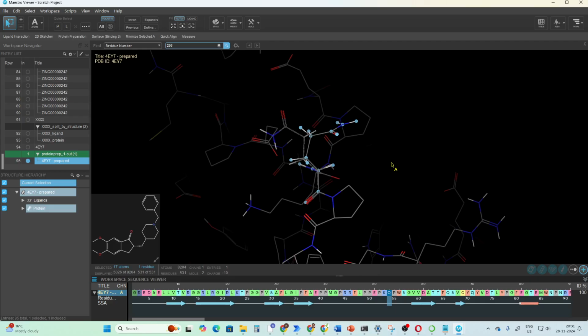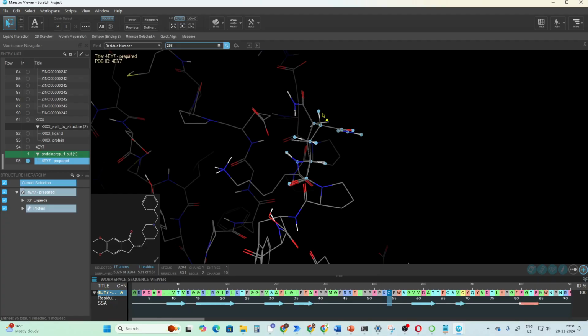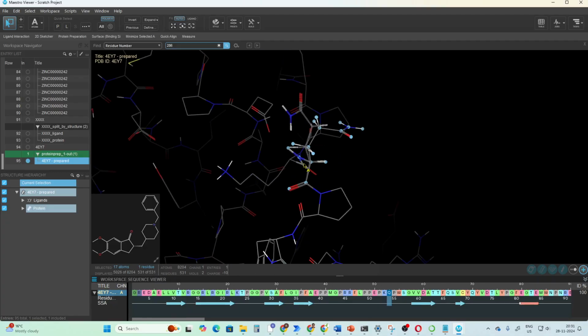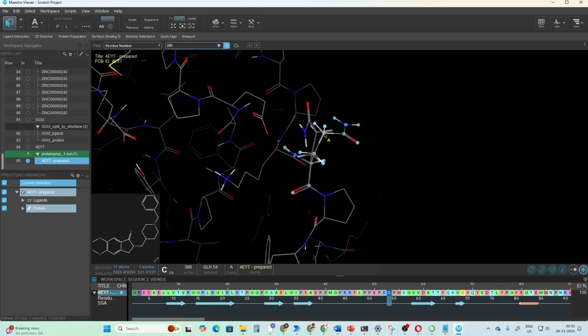So in this Rotamer library, they are storing the sidechain conformers of very finely crystallized experimental structures of the proteins, okay. From databases they are collecting, and they are trying to see if they have a similar backbone, how is the conformation, or a similar side chain, how are the conformers arranged, okay. So for conformers that are arranged at that particular percent of the time at this particular position, it is likely that this should be the conformation in nature, okay.